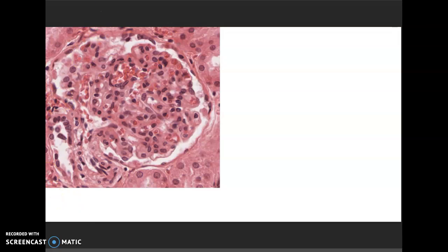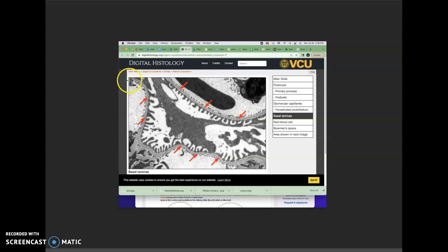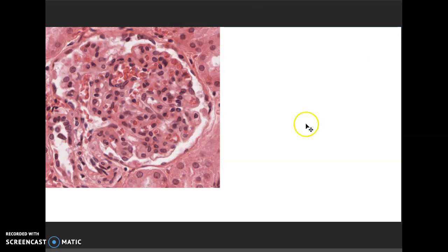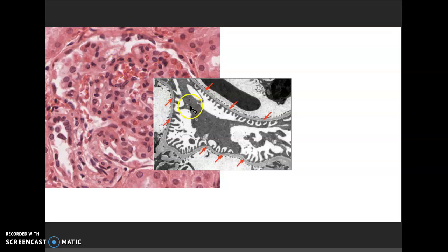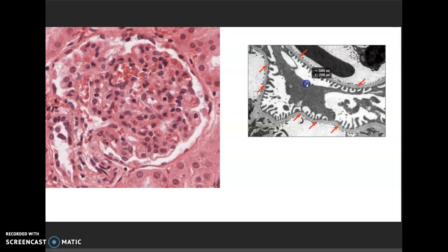And we are going to take the electron micrograph. And again, you're not going to have these nice, beautiful red arrows on it. And we're going to paste it in as the other half. Voila, like so. And maybe make it a little bit bigger so it fits in there.